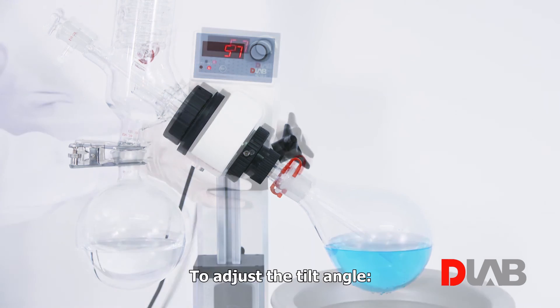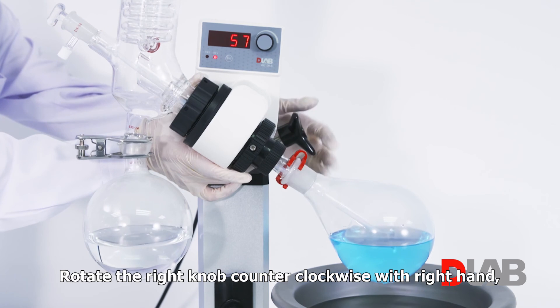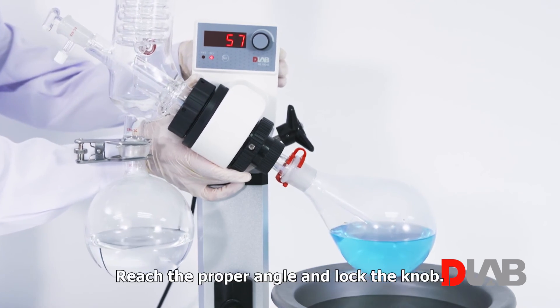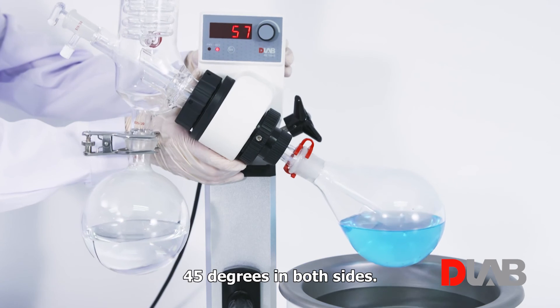To adjust the tilt angle, hold the main body with the left hand. Rotate the right knob counter-clockwise with the right hand and tilt the assembly gently. Reach the proper angle and lock the knob. The range of tilt angle is 45 degrees on both sides.